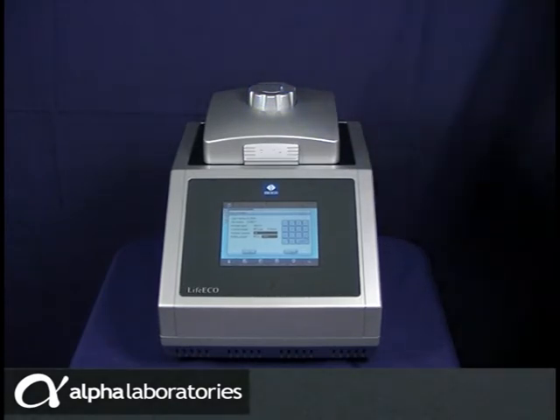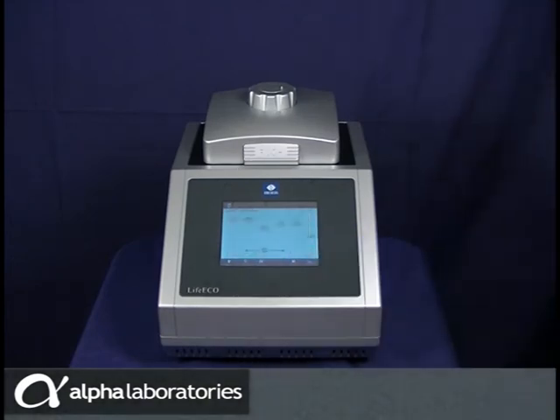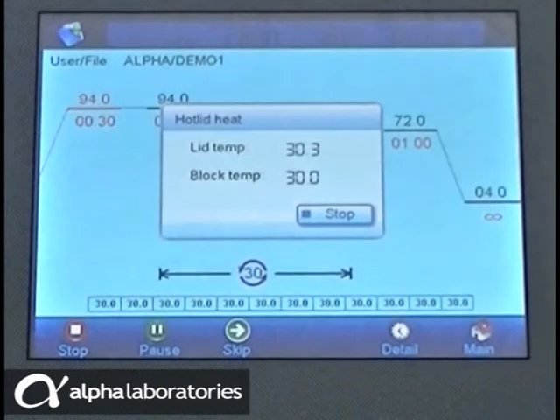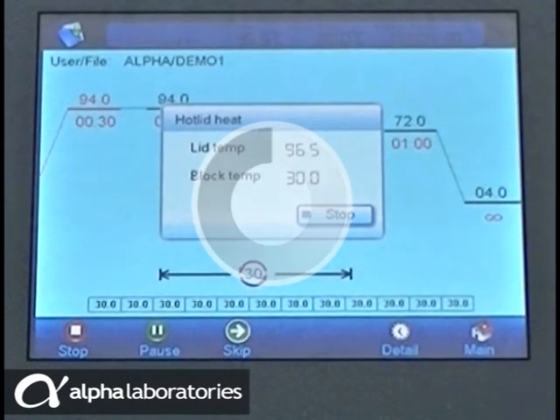The process starts and you will see the lid temperature start to rise. Once the lid has reached its target temperature, the protocol is initiated. The block is brought to temperature and timing of each step commences. The graphical display highlights the current step at every stage of the protocol and there is an option to switch to a summary detail view.